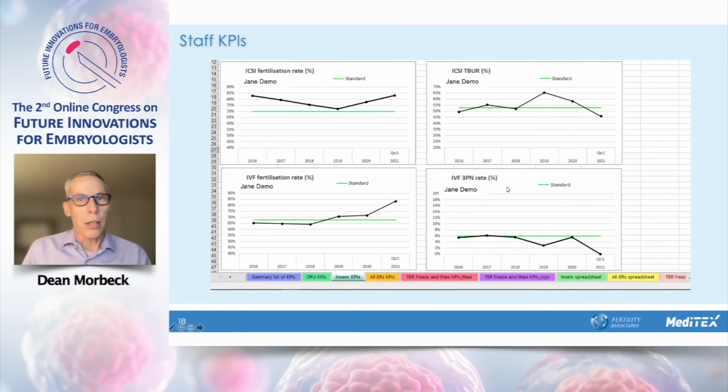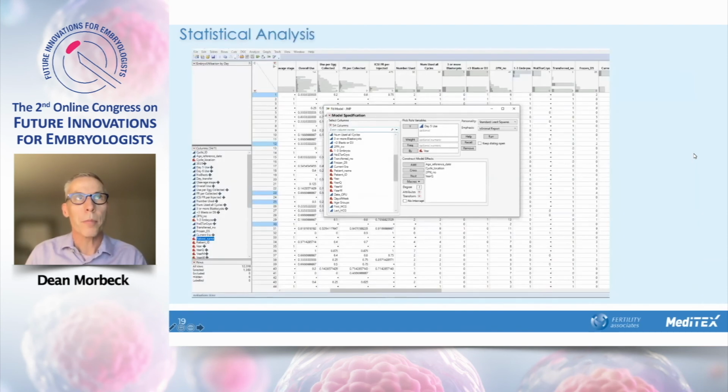We've got many of these, but again, it's just having the data automatically entered on every patient, which is really quite useful, and relatively easy to get out and turn into this type of good month-to-month granular data, which we find is useful for tracking performance and needing to institute any kind of correction.